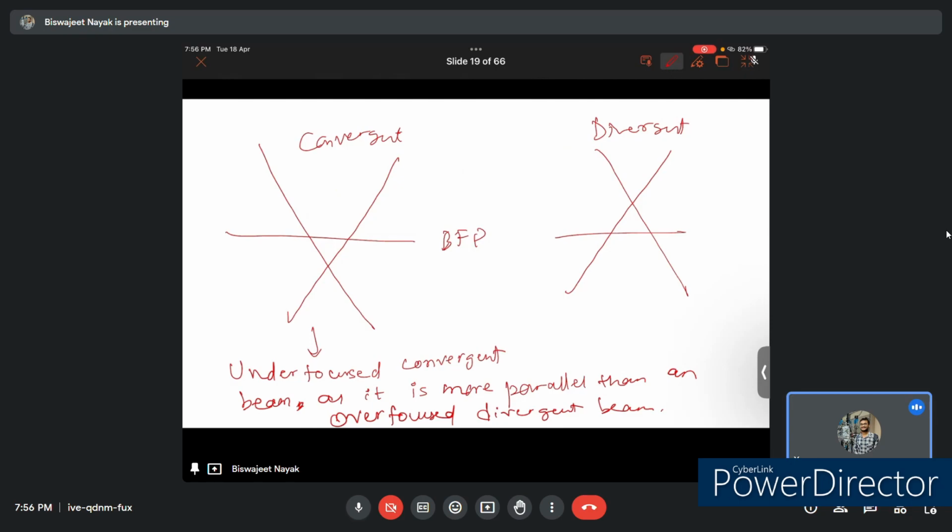So to understand what is happening, first we reduce the magnification of the specimen at the back focal plane to 0. So as we increase the strength of the intermediate lens, if we are going to stay in diffraction mode, we increase the magnification of these images. The images are not in focus, but this can be corrected by adjusting the strength of the objective lens.